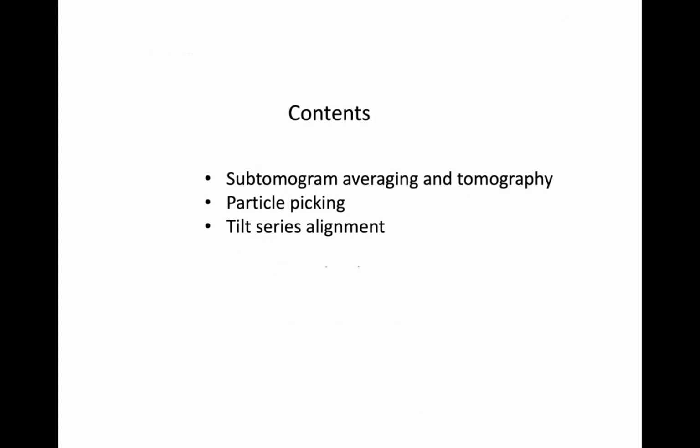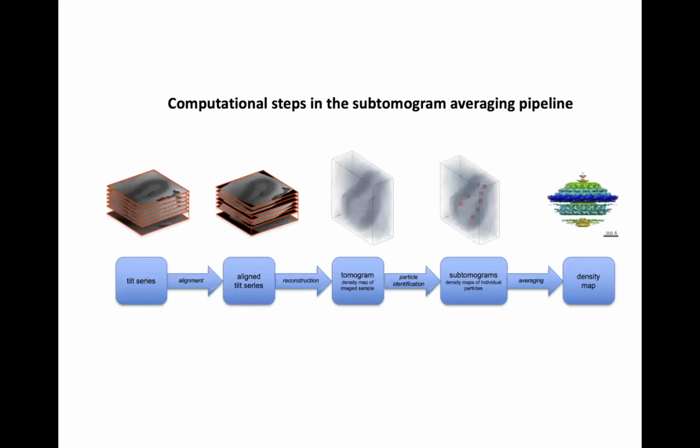So I will talk about subtomogram averaging itself, also about particle picking for subtomogram averaging, and about tilt series alignment. And also, as I'm talking for SBGrid today, I will talk a little bit about Dynamo as a development system and what is inside Dynamo itself.